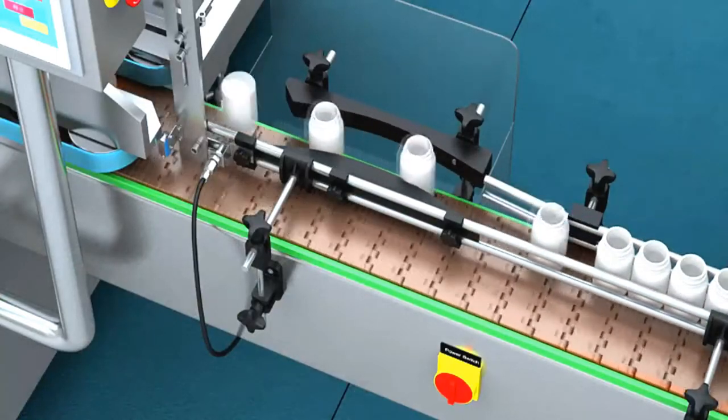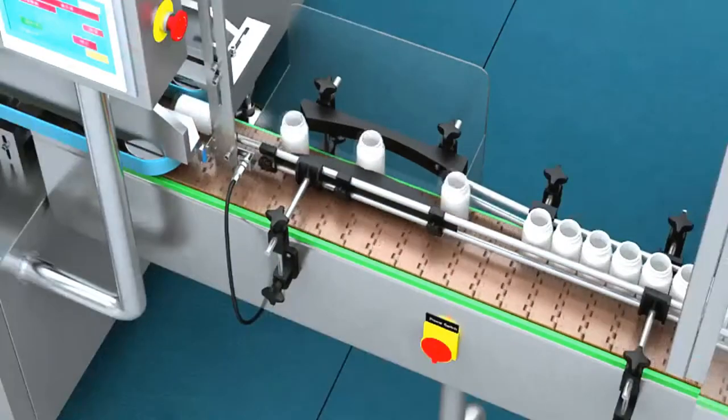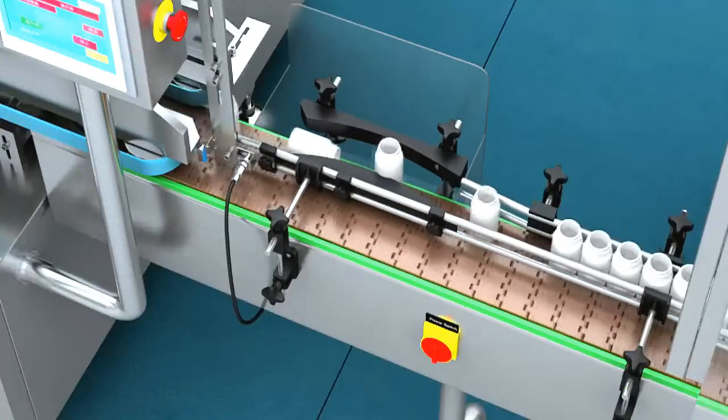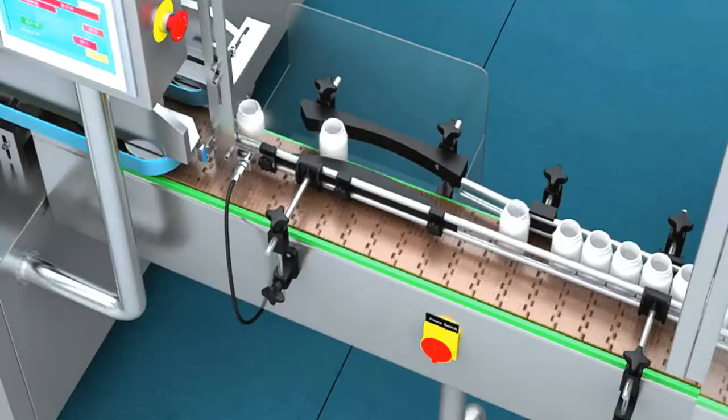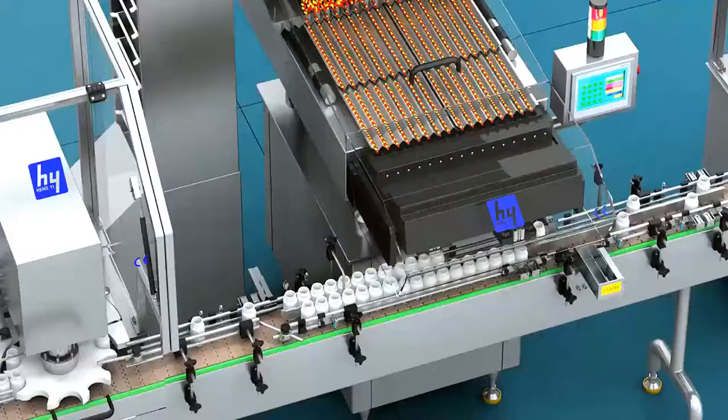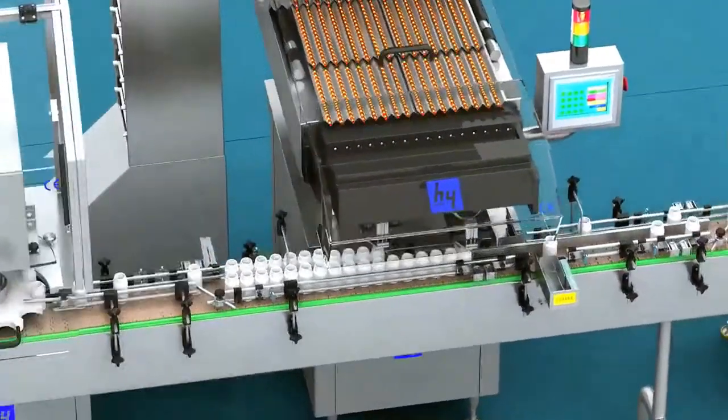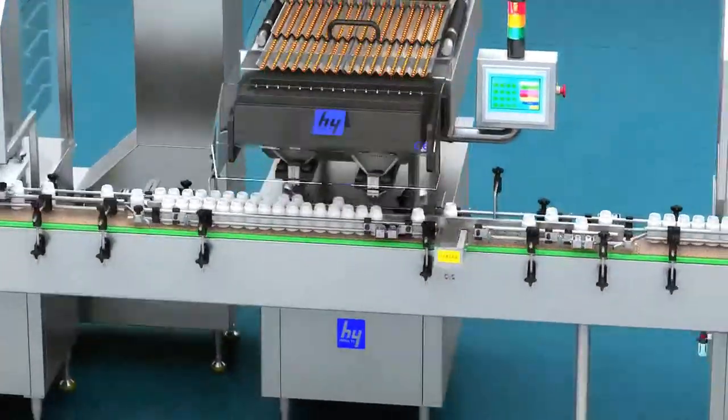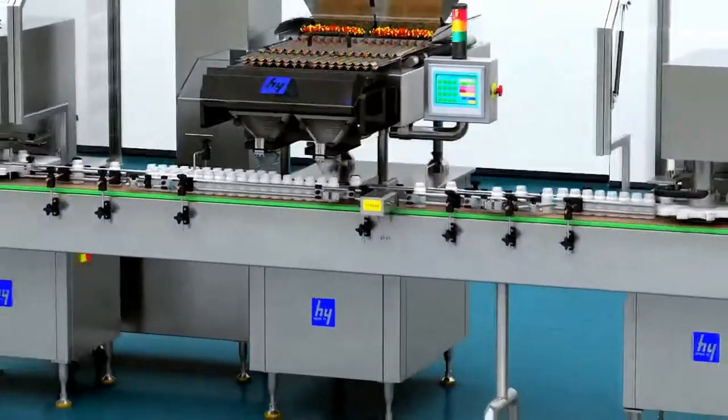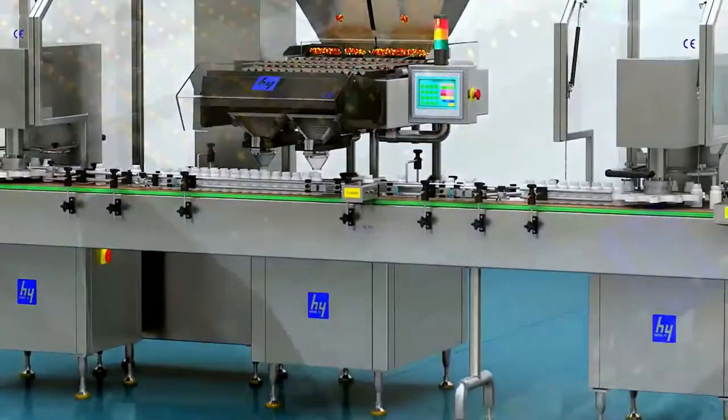This machine carries inverted bottle and opposite bottle detection to ensure 100% complete bottles can be delivered to the next procedure.